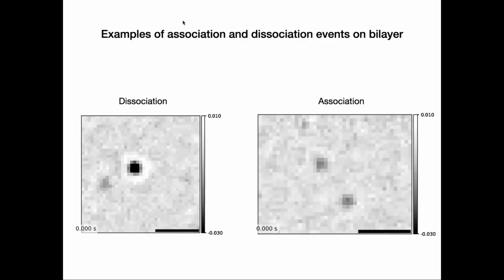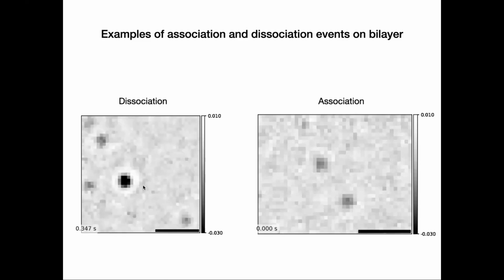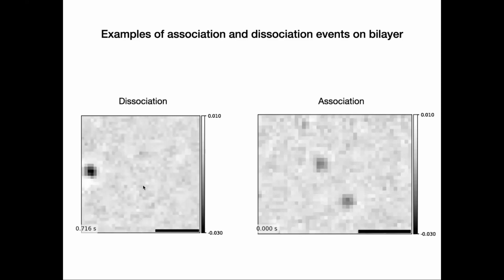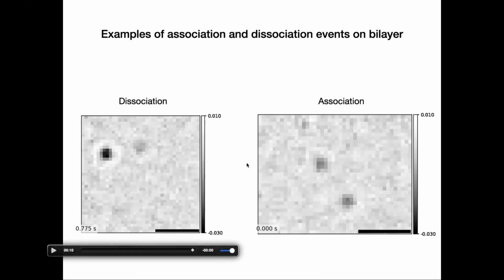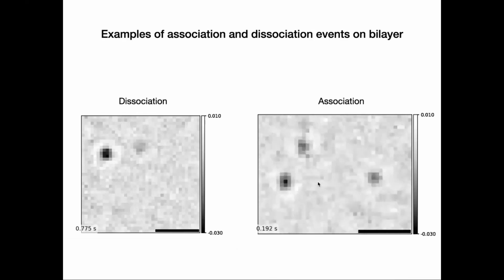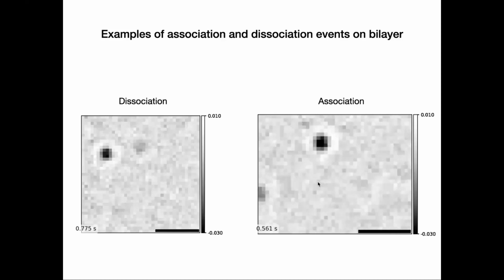Yeah. So basically, they have found quite rare cases for their example where they show a dissociation event. You can see this central particle is moving around and then it splits into two. So this does happen, and you can watch it. And also sometimes you can see particles actually merge into a bigger particle like this.